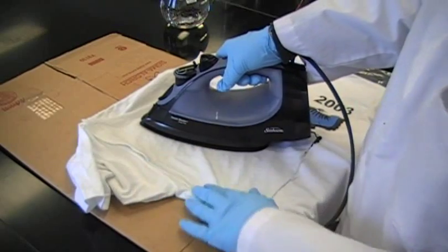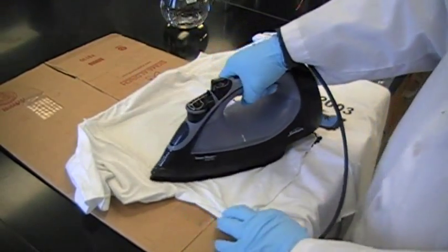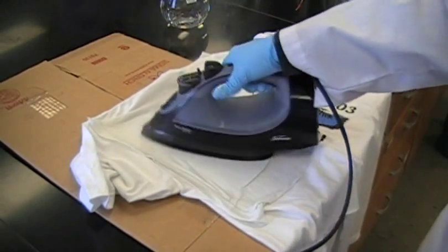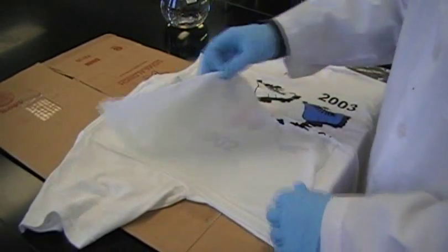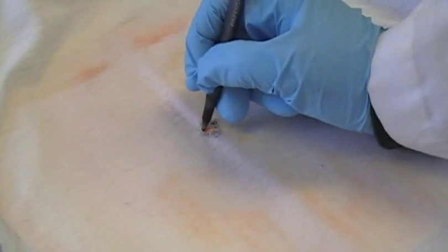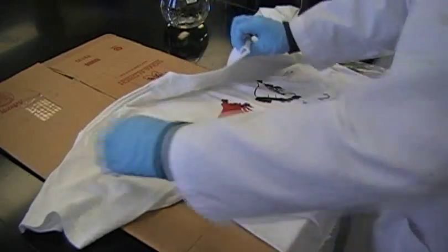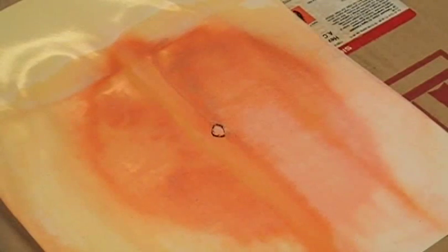It is then ironed until dry. The cheesecloth is peeled off and discarded. The bullet hole is marked, and then the t-shirt is peeled off the paper. Any traces of GSR will remain on the paper with a pinkish color.